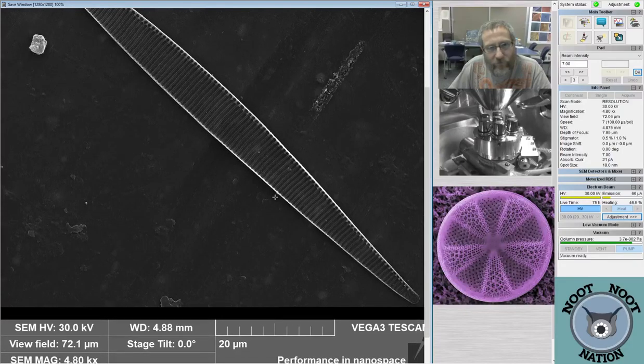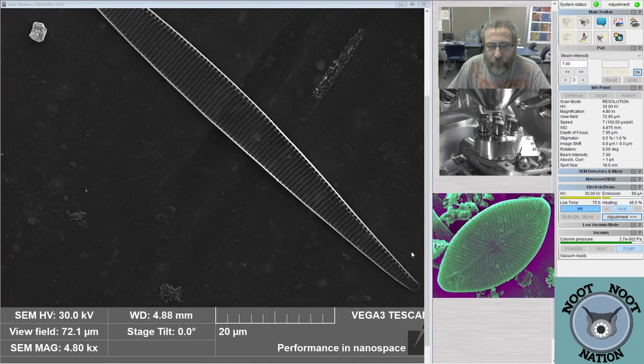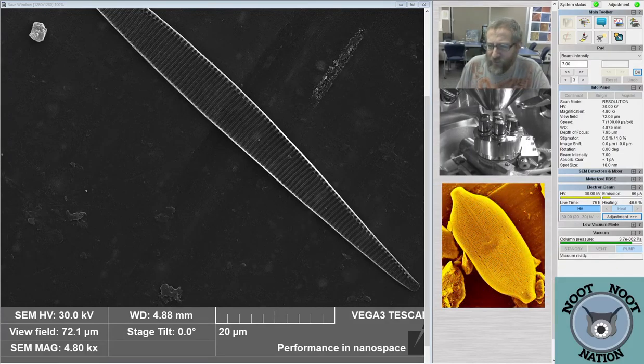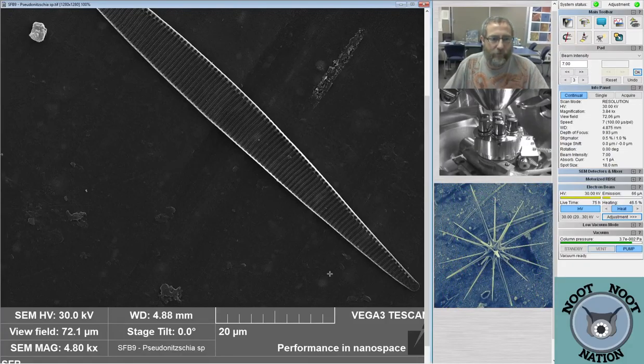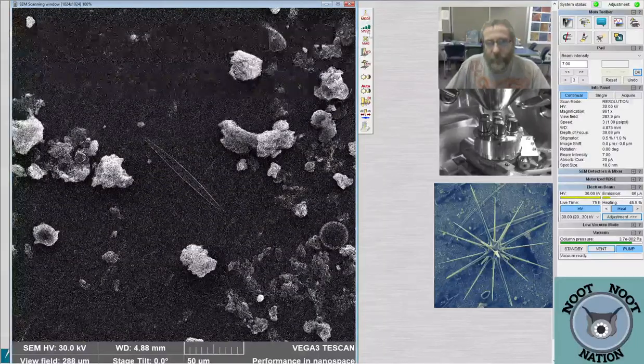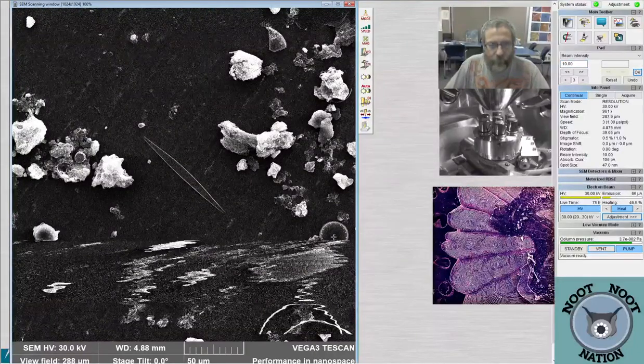It's so cool. So these are the ones, well, it's a type of Pseudo-nitzschia that produces domoic acid. Not necessarily this individual species of Pseudo-nitzschia. So I get to look up how you identify the differences. I don't know that there's more than one species of Pseudo-nitzschia, is there? Oh yeah, I want to say there are three or four different Pseudo-nitzschia we get. And of those, there are two main size classes, and only one of them is the toxigenic, the ones that make the toxin. And then of that group, they only do it sometimes.